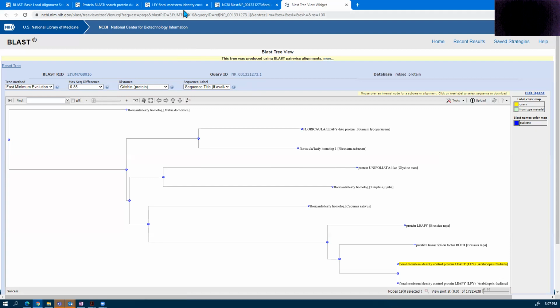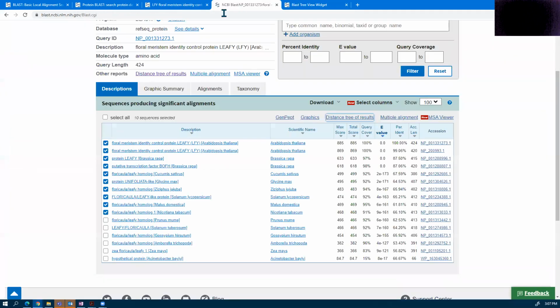So certainly everyone's results, as to be expected, are going to be unique. So we will help you in the lab to choose if your gene doesn't apply, if these rules don't apply for your gene, the 3 different options I've gone through with you here, then certainly we'll go through it with you during the lab and help you in selecting which results from the protein BLAST should be included for your distance tree of results.